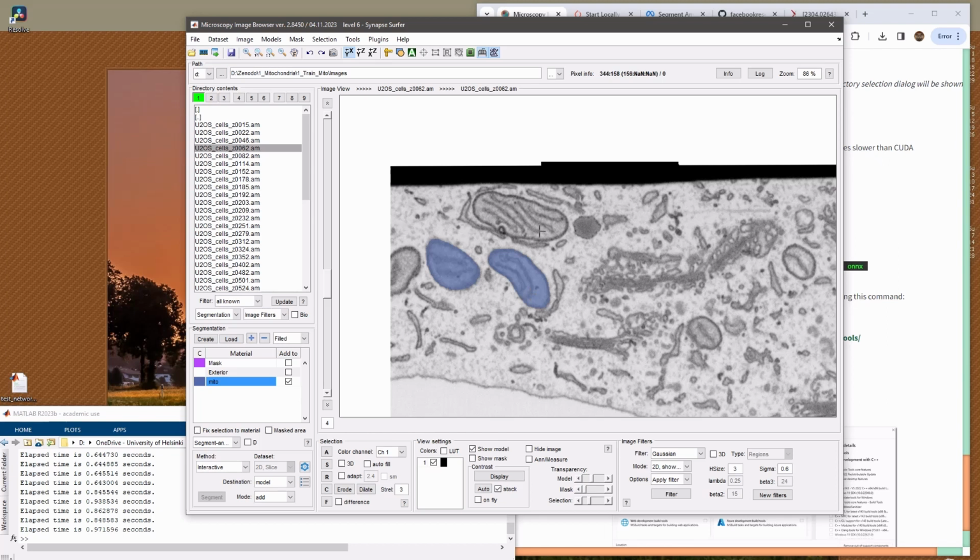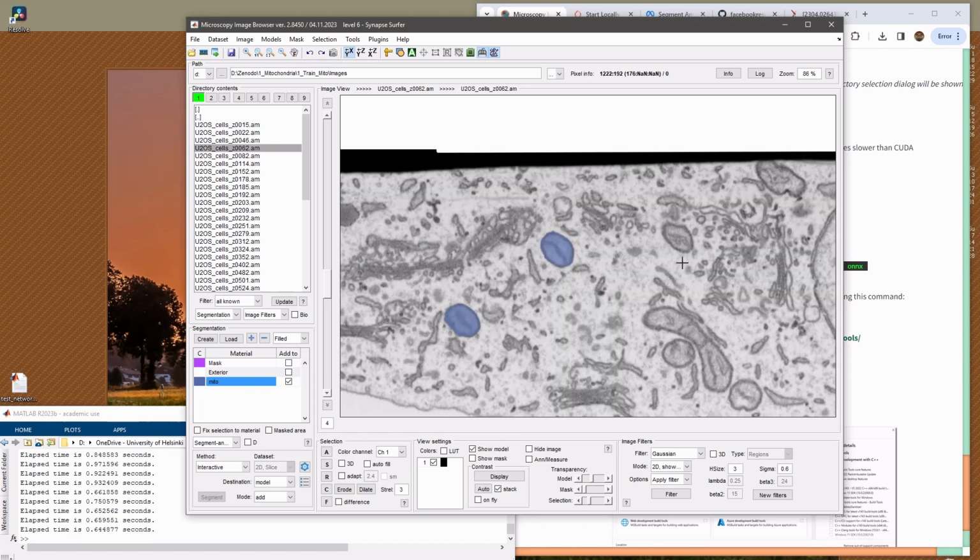If it gets really messy, and for example I clicked Shift to get the other one, and I don't like this, I can press Ctrl Z, and it will undo the last object. So it will undo the operation which happened after the left mouse click. So let's go on this one, hold Ctrl here, and then it's done. Again, left click, Control click, done, left click, and so on. So this is one of the options.